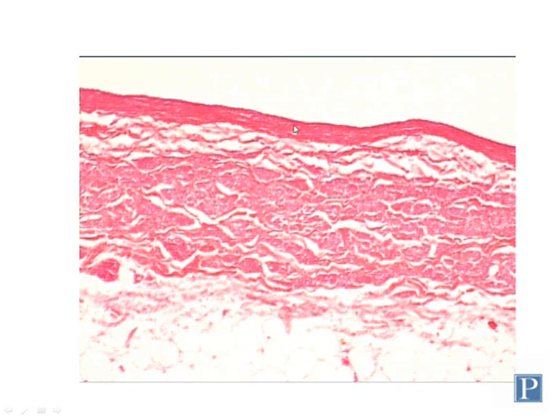So it's not nearly as large of a structure. Most of the width of the wall of this particular type of blood vessel is all tunica adventitia, which oftentimes contains smooth muscle scattered throughout the connective tissue here, which helps to propel blood along the vein.